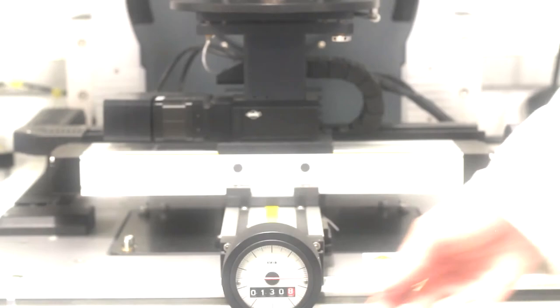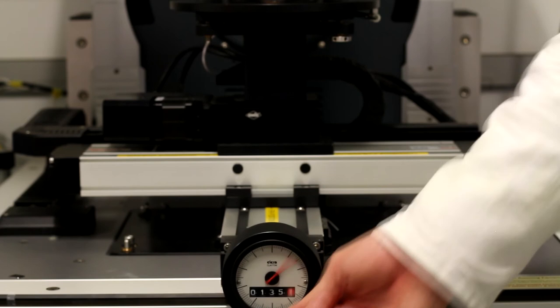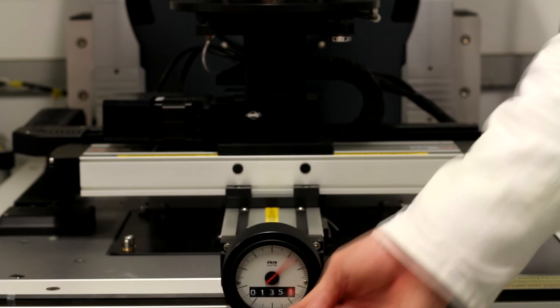The stage can also be adjusted in the XY direction, allowing for potential mapping of sample properties. The SE2000 is also equipped with an environmental chamber which allows the measurement of ellipsometric parameters under controlled humidity conditions.